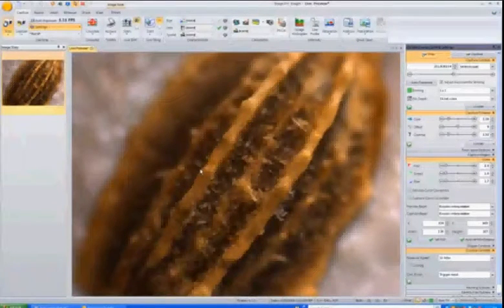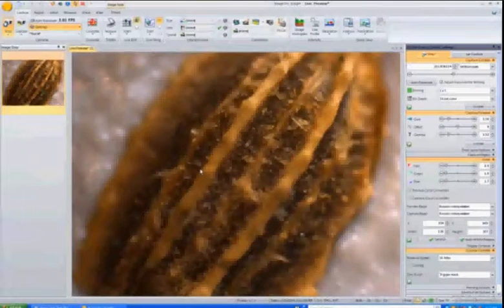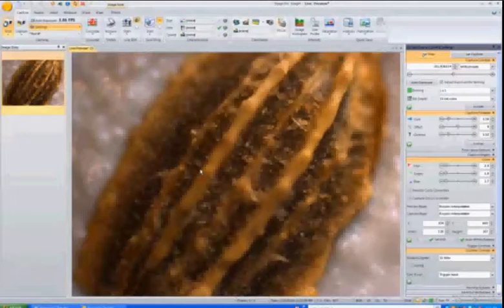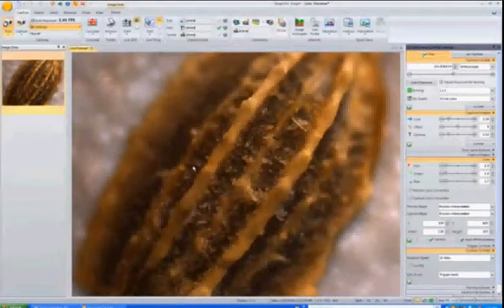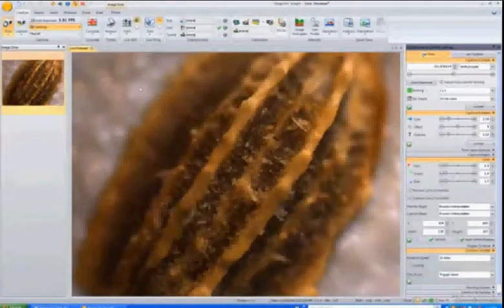As you can see, the depth of field of this particular objective is insufficient to image this entire object. This is a cucumber seed. We are going to ask Live EDF to help us to get the entire depth of field of this whole seed without any motorized functionality on the microscope whatsoever.